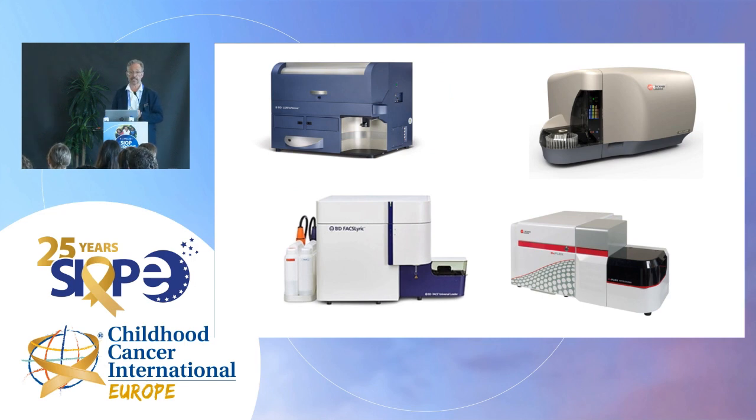You know, nowadays, I remember the time when I started, we were with a screwdriver, working on the machine to change things. And this is not happening anymore. So these things work almost alone. You can put your samples in, and there is a carousel, and it works through automatically. So times really have changed, and the machines in former times were big like that, and nowadays they are tiny like that, and there are also machines you can even carry on.